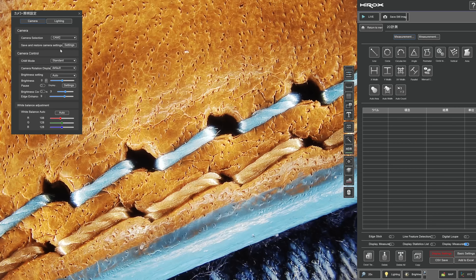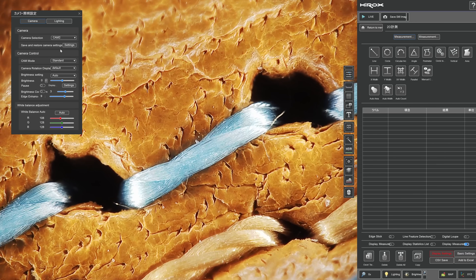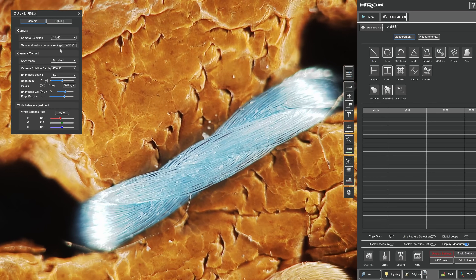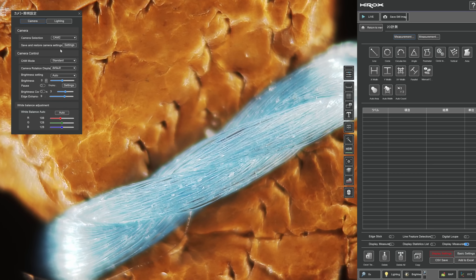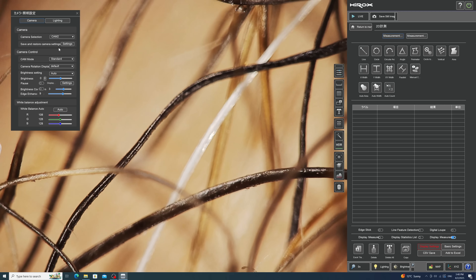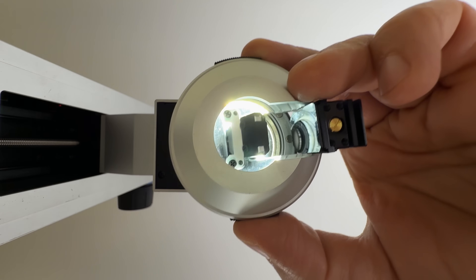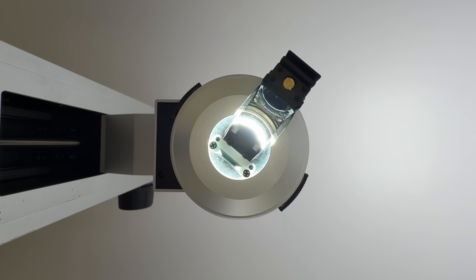You can also zoom in — for example to look at a specific detail. I can see the single fibers here. But really, this is just a teaser for the main event, which is that add-on to the microscope that gives you drone-like shots.